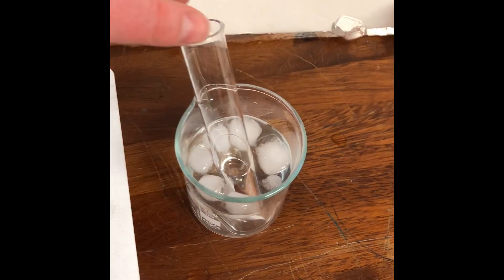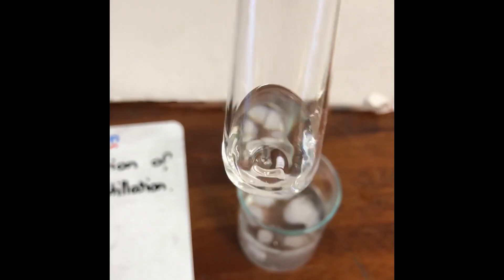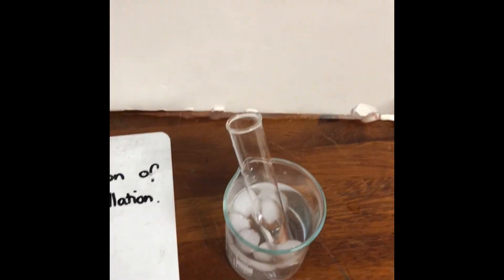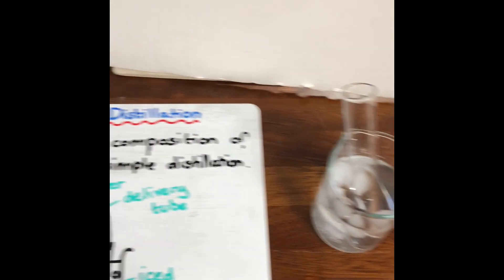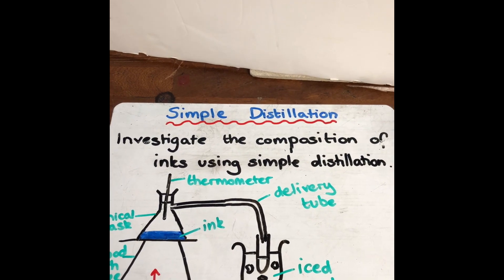And you can see that if I take the boiling tube out of the ice water, there is just some pure water in the bottom. And in the conical flask, which you can't see right now, we just have the ink left. And so what we've done is we've separated the ink from the water. And that is distillation.